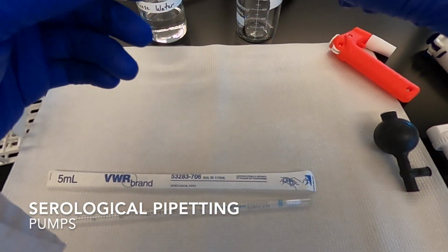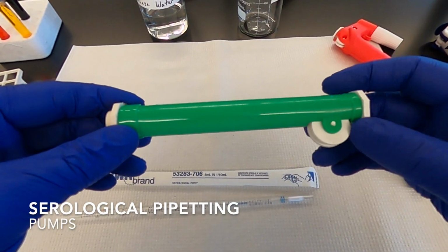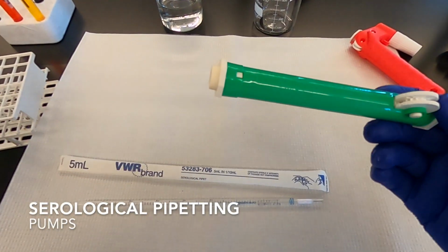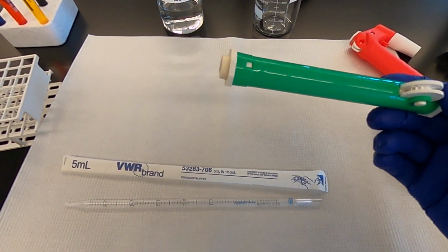So we're going to mostly use these, which are 5 to 10 milliliter pumps in our labs, and because they're made to pipette 5 to 10 milliliters, if you use them with our really small 2 milliliter pipettes, you need to be careful not to over pipette with them.